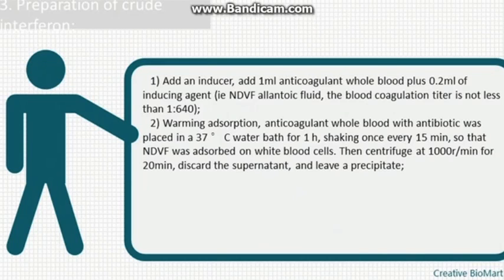2. Warming adsorption. Anticoagulant whole blood with antibiotic was placed in a 37°C water bath for 1h, shaking once every 15 min, so that NDVF was adsorbed on white blood cells. Then centrifuge at 1000 R/min for 20 min, discard the supernatant, and leave a precipitate.